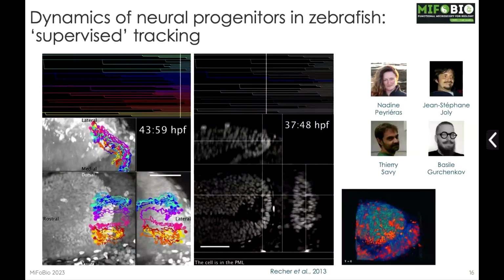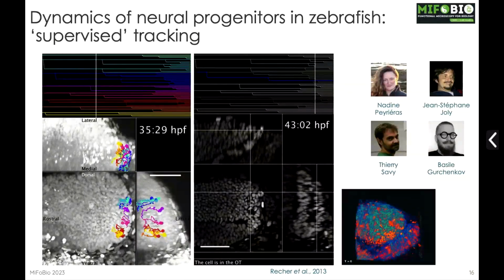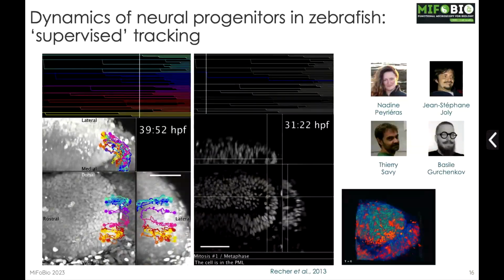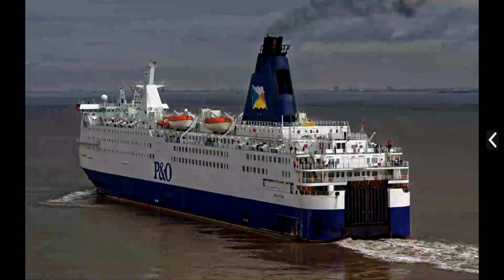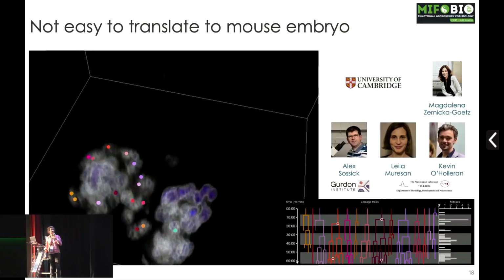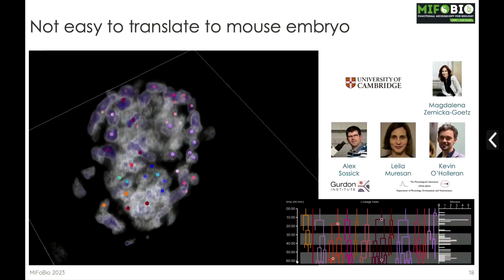And so that was in 2013. Now things have improved because now we have other strategies to image the thing. Maybe you want to degrade the image, but go faster, and then you have more information, paradoxically. And then after Nadine's, I crossed the channel and was trying to apply the same techniques in Magda Zernicka-Goetz's lab, and actually to mouse embryo.